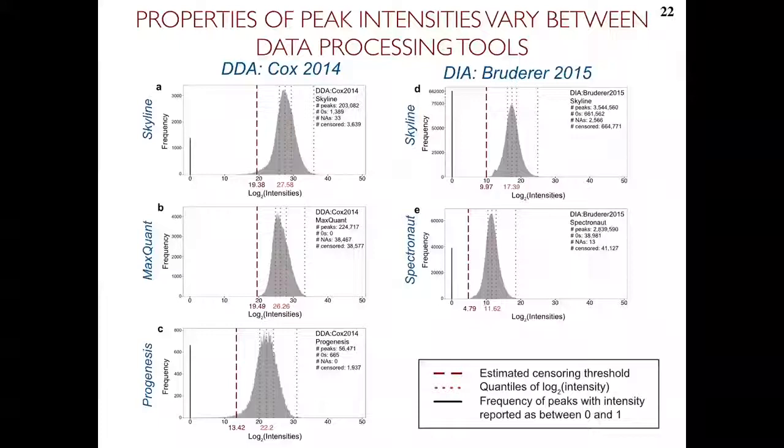And in the beginning, we were worried a lot about formats and converters and just making it happen, taking files in one format and actually reading them into MSstats and making sure that things work. But very quickly, we realized that there is more to it than the formats. Because what turns out is the different tools, and you have seen already between Skyline and DIA-Umpire, and you will see Spectronaut as well, and many others, are developed by different labs and they make different decisions for good reasons.